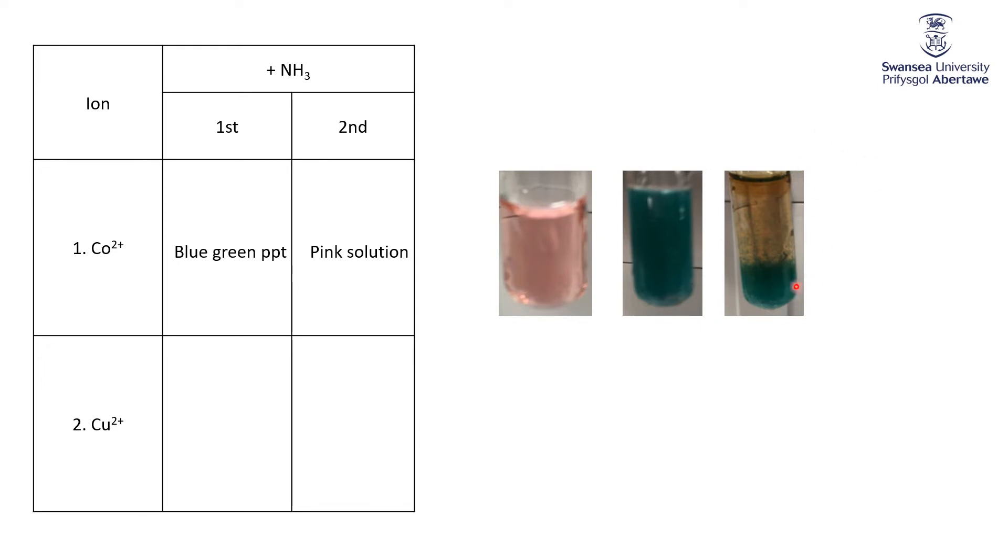So again, you can see there's some of the blue green precipitate that I haven't reacted up yet, but there's some of that pink solution coming back again that is essentially cobalt ions with some ammonia bonded to it, ligands, ammonia ligands bonded and water ligands bonded to it.